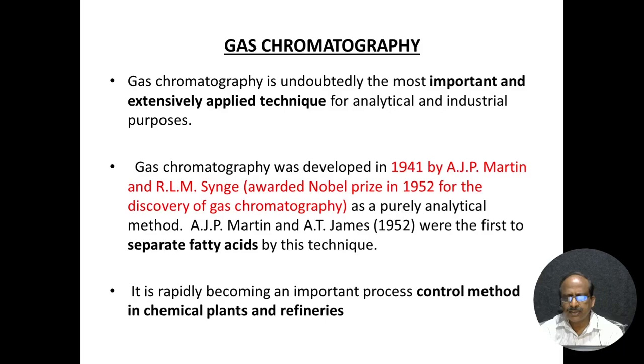Gas chromatography is undoubtedly the most important and extensively applied technique, for analytical as well as industrial purposes. This is the most important for industrial purposes. That's why it has the widest applications among analytical techniques.